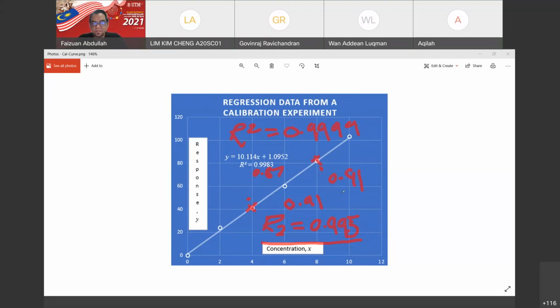Okay. Yes, someone got this value of R squared in preparing the calibration solution, right? If you regularly do this calibration solution, you know where the mistakes are that you need to avoid. You can have this. Okay.